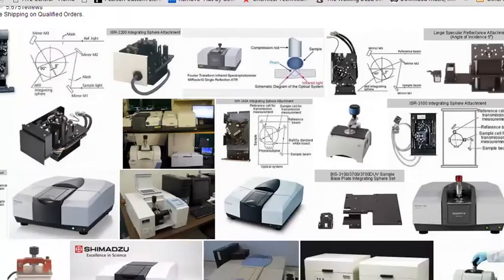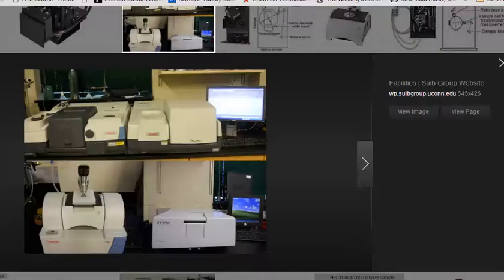And the FTIR attachments will all look a little bit different, but it's like a TV. They have very similar features on them. So if you look at the top piece on this instrument here, you see almost like a huge, what I'm going to call anchor that points downward at the sample platform. That is almost the traditional ATR attachment look.